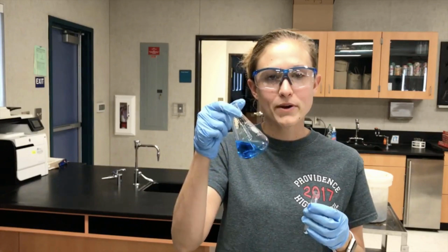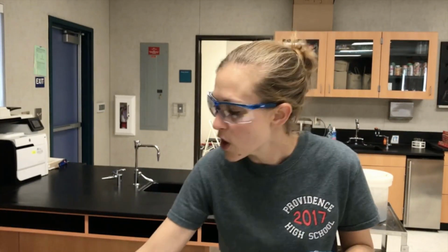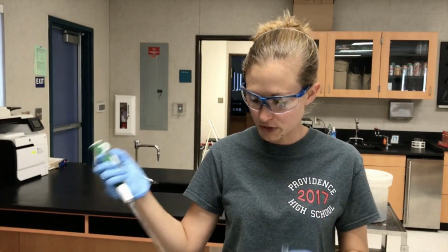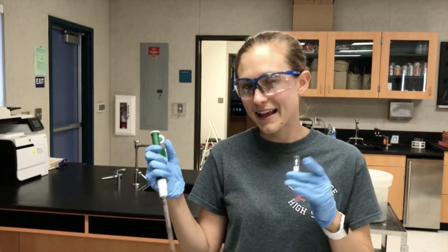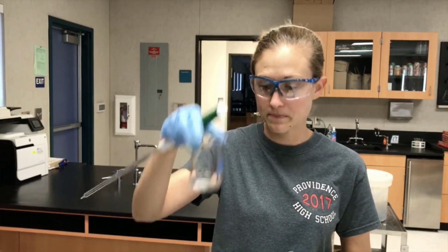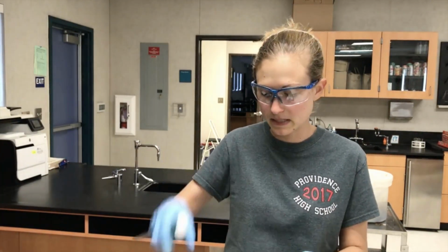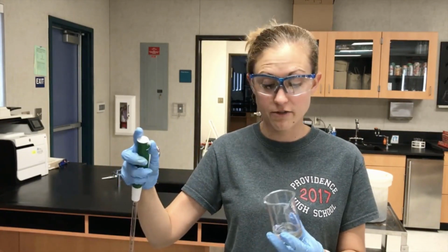Well, I can add the 0.4 molar solution really easily and not have to do any calculations or any work. So what I'm going to show you is creating the 0.2 molar solution. So since I want 8 mLs of solution, I'm going to take, and you should have gotten this from your calculations, 4 mLs of my copper nitrate, and then I'm going to take 4 mLs of water. Now, what I normally do is I fill all of the cuvettes with a proper amount of water for each of them, and then I fill them with copper nitrate because that prevents you from actually contaminating any of your substances. So I need 4 mLs of water.